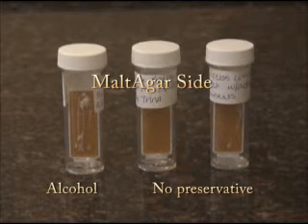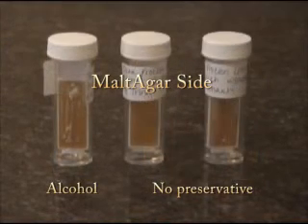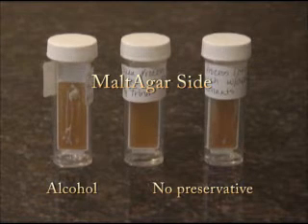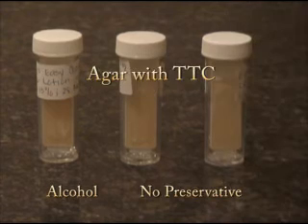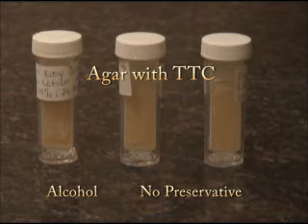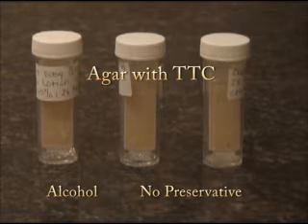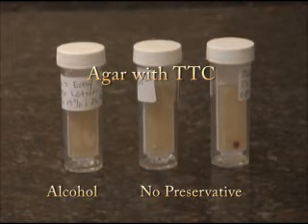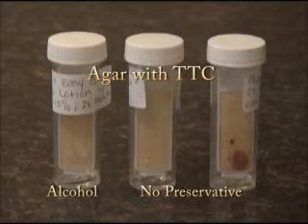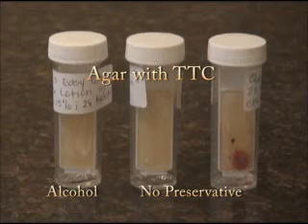Generally, a clean result — in other words, nothing's growing — after 72 hours means your product passes the sterility test for bacteria and yeast. Molds can take a little longer to develop, though. We have tested two lotions today. The first is an alcohol-preserved lotion that has been in use for about six months. The second is a freshly prepared, unpreserved lotion. The third example is the unpreserved lotion that has been contaminated by organisms as may occur in day-to-day use. This sequence shows the slides developing over several days. Both the preserved lotion and the fresh lotion test sterile, but we have growth on the test slide from the contaminated, unpreserved lotion. The red dots indicate that bacteria are present.